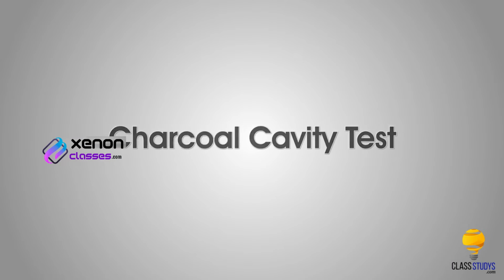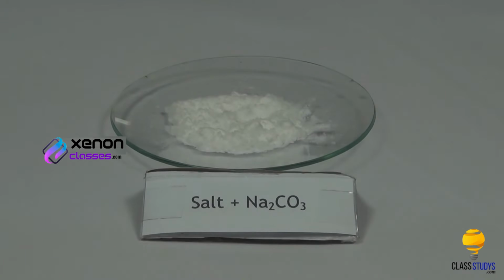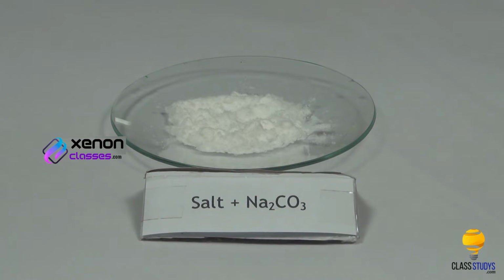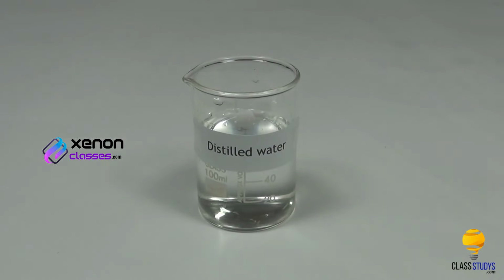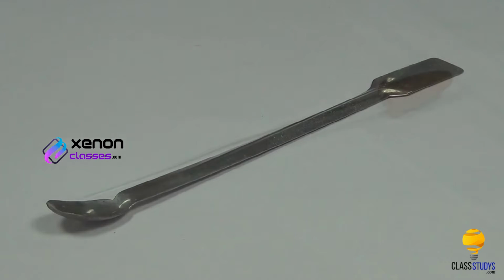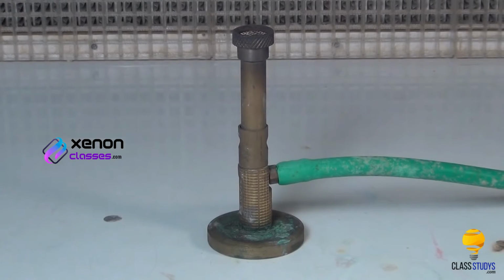Charcoal cavity test. Materials required: mixture of salt and sodium carbonate in a watch glass, charcoal piece, distilled water, spatula, dropper, tongs, blowpipe and Bunsen burner.